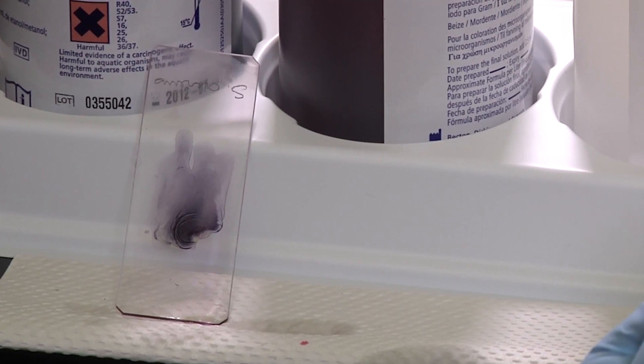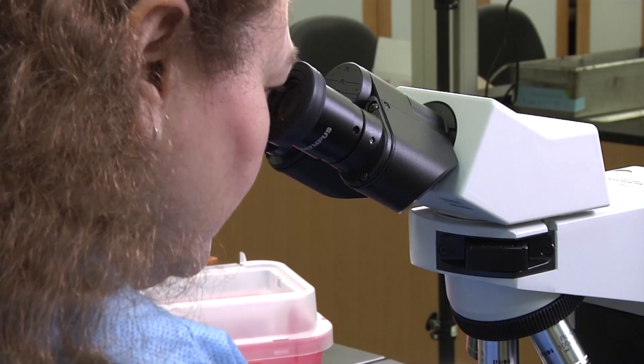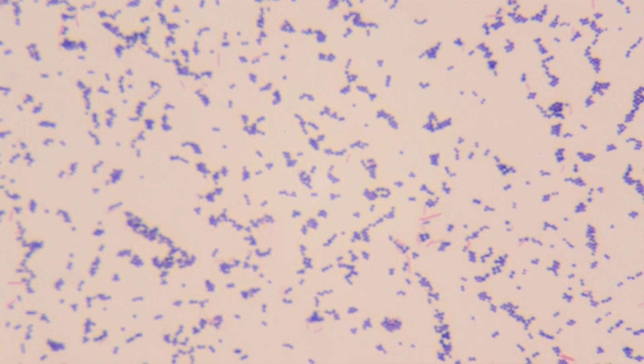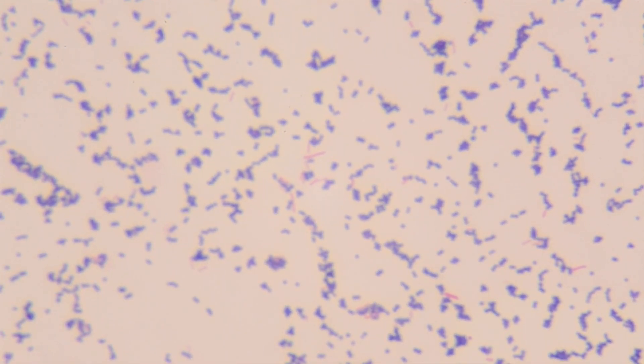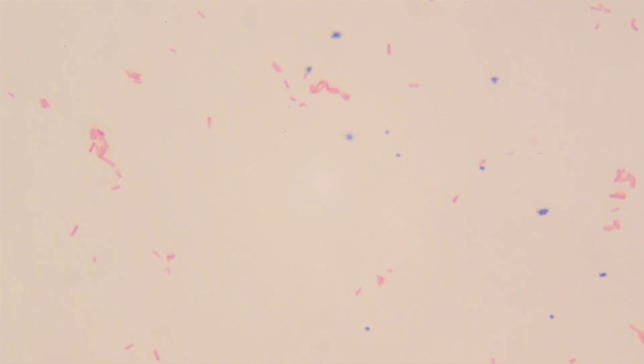After the slide has air dried, it can be examined under the microscope. Looking under the microscope, you will see organisms that are gram positive purple or gram negative pink. Here, you can see Staphylococcus aureus, which is gram positive. And here, you see E. coli, which is a gram negative organism.